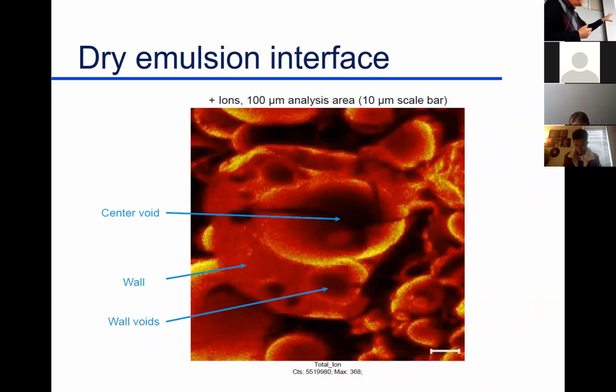But it's interesting, what is the structure of that particle? This is a technique where I can look at that particle and see how it changes as water evaporates, as flavor moves out of it. I can do mass spectra and get an idea of the structure of that particle. I can better understand how to make a better structure, a less permeable structure. I want to trap it there, then dissolve it, and have it released. We have scanning mass spectrometry that has a limit of, I think, about 2 angstroms. It can look virtually at molecules across a powder.